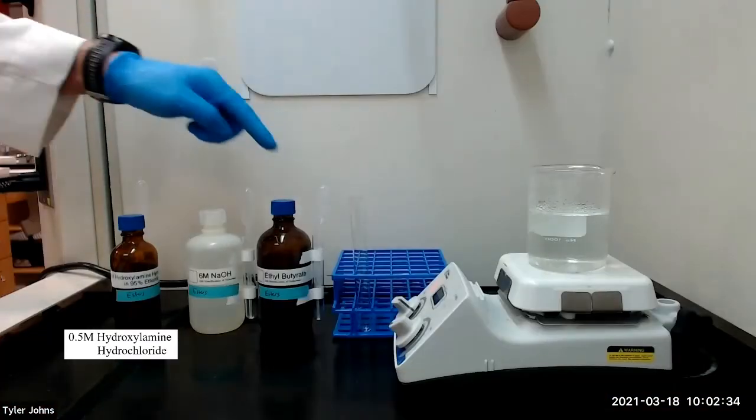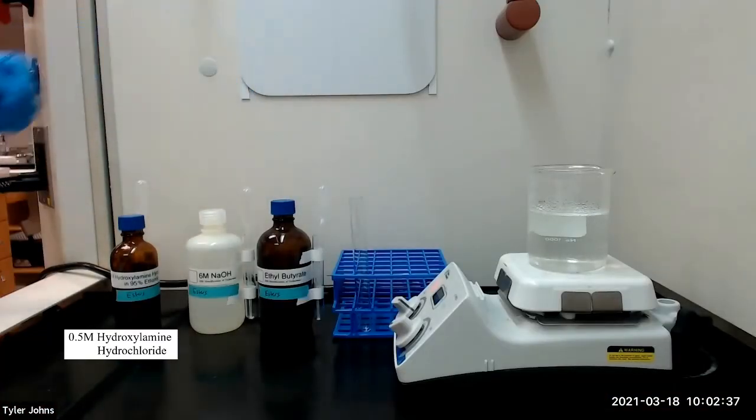Since our test compound ethyl butyrate did not show enolic character with the ferric chloride test, we may now continue with the ferric hydroximate test.